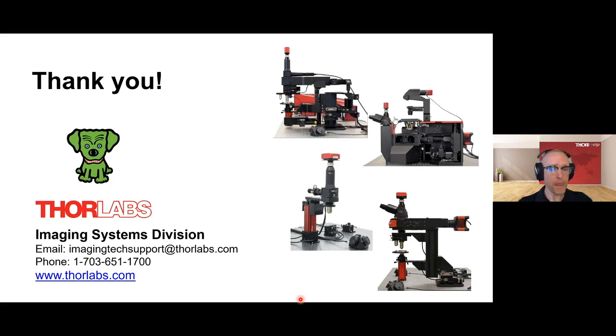The next one, I think you very clearly described it, but it will be nice to do it over again. Is there a specific type of PMT that we should use? What is the difference between GaAsP and multi-alkali? Yeah, absolutely. In practice, Hamamatsu makes the PMTs that we use in laser scanning, and they have multi-alkali and GaAsP PMTs. The GaAsP PMTs have a higher quantum efficiency, so the 40% quantum efficiency that I quoted in the talk is for GaAsP PMTs.